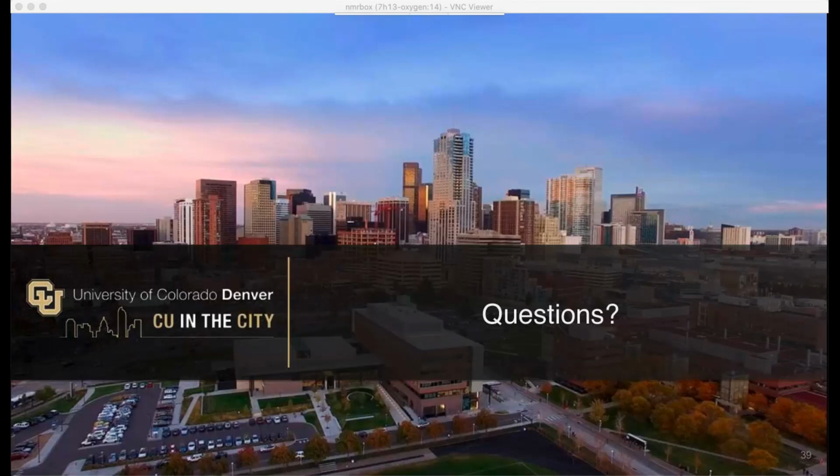I was particularly interested in whether this software would be compatible with Mac software. OS X Catalina has been causing no end of problems with lots of software recently.